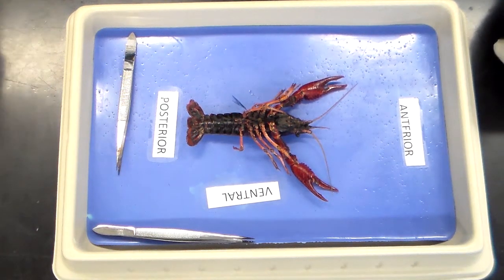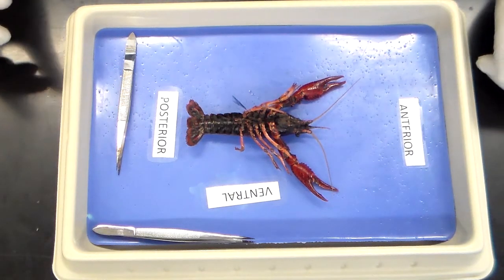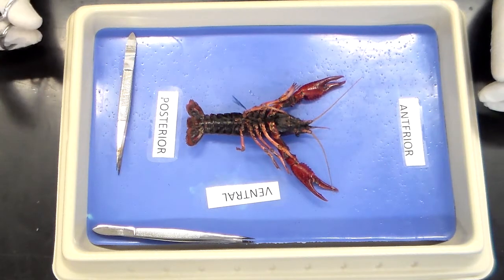All right, now let's begin our dissection. This cut must happen almost immediately from removing the crayfish from ice. You do not want to idle too long.